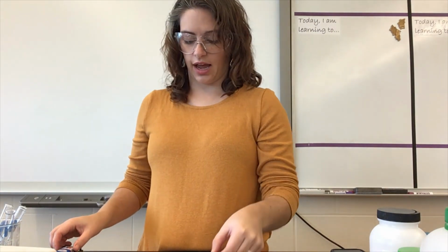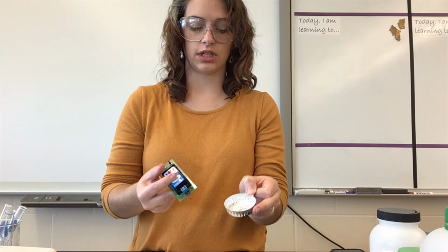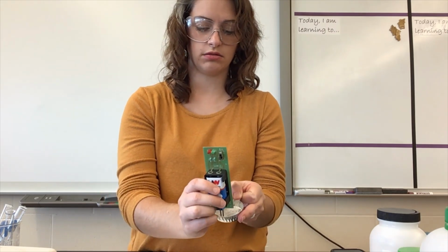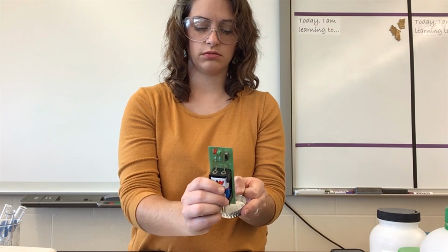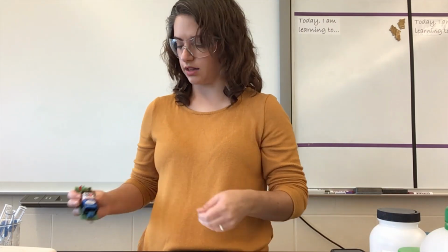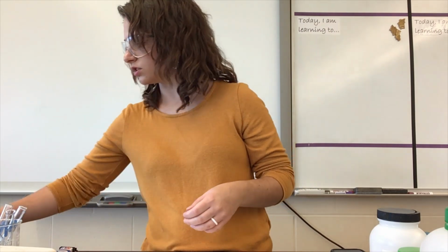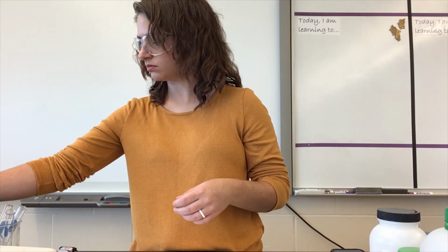Okay, let's look at conductivity. So testing it as a solid. Not conductive, no light. Okay, so not conductive as a solid. Let's check it as a solution.